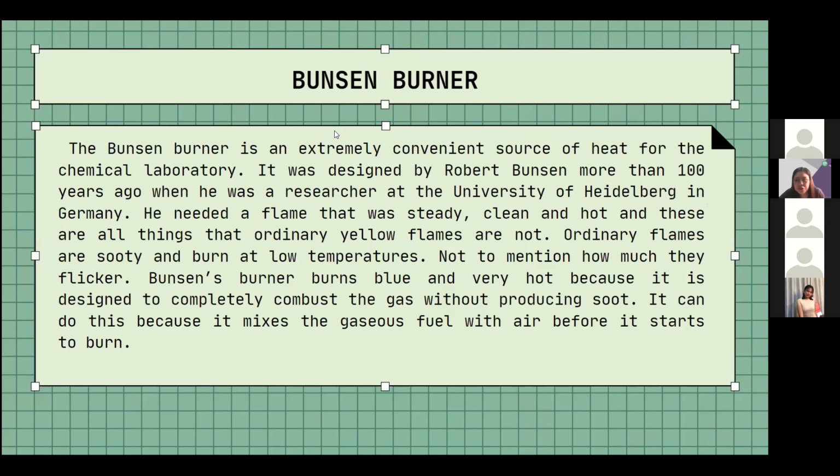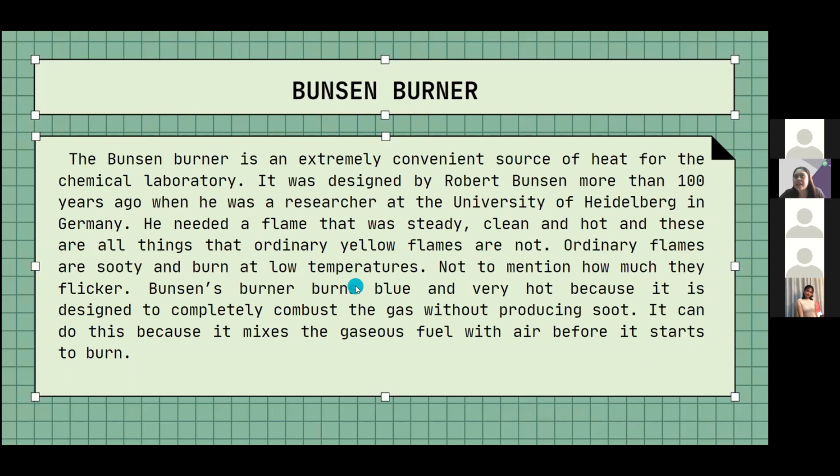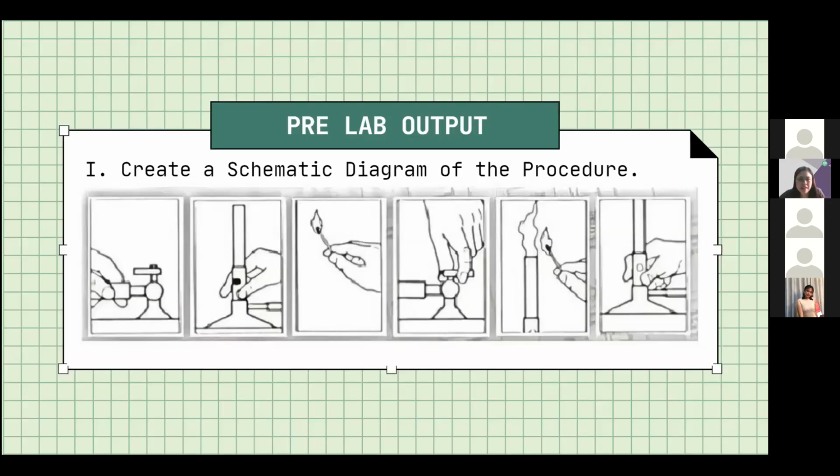So do not forget it was discovered by Robert Bunsen when he needed a flame, kasi kailangan niya din ng stable flame para sa heating and boiling niya na experiment. So that's the reason why na-create si Bunsen burner. So doon na lang pala tayo sa Lorraine, kasi ito na pala yung almost the first slide, no? Doon tayo sa procedure and how to manipulate this one, the schematic diagram.